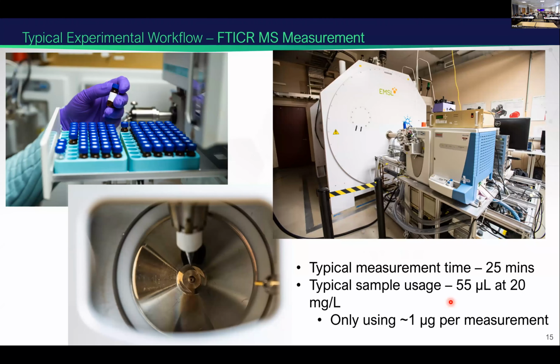And then we do our measurements. So we put our little sample in a little vial. We have infusion carts that automatically sample it. So we can run on the order of 50 to 100 samples a day. And then this is just another picture of our instrument.